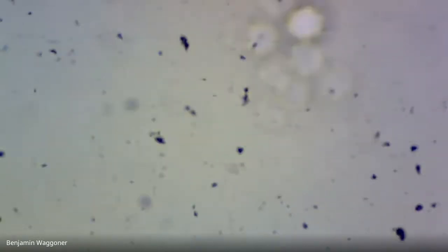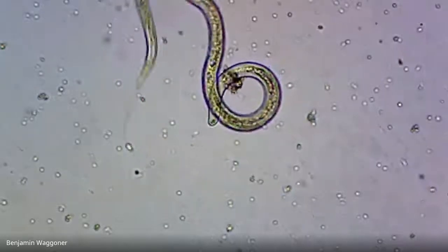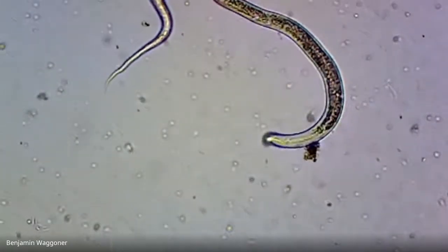All right, we're looking at a second wet mount of this sample. And there's one. Not moving too fast. There's the head, and then the tail's really pointed as usual. Okay, maybe I spoke too soon when I said it wasn't moving too fast. Maybe it doesn't like the light.